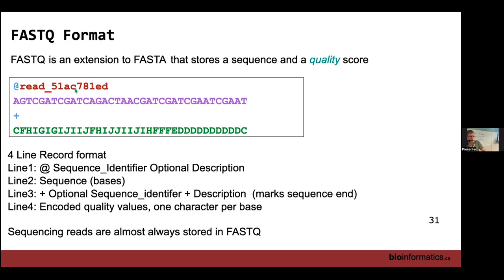In Illumina sequencing, we talked about reads appearing in tiles and images. The identifier is usually a position on the flow cell, XY coordinates, a tile number, things like that. Illumina actually puts a lot of information in there, including an instrument model and an instrument run, but it can be anything. Unless you're writing something very specific, it really is just a name for the sequence.